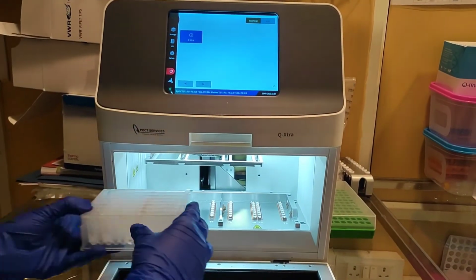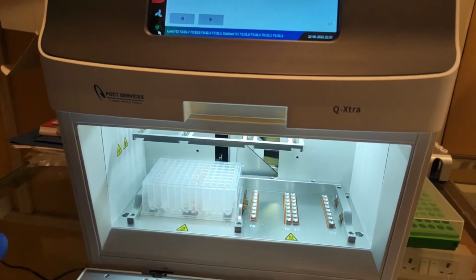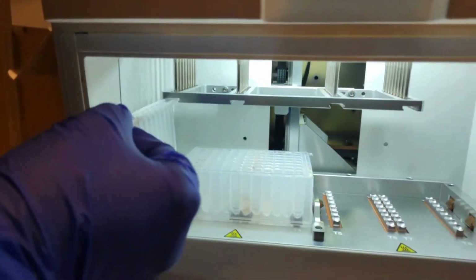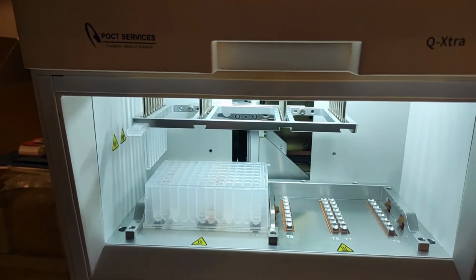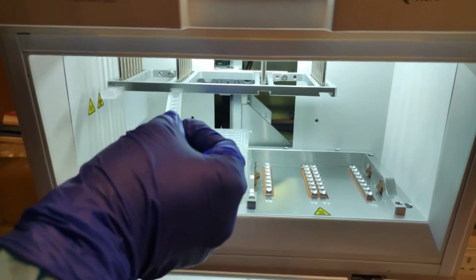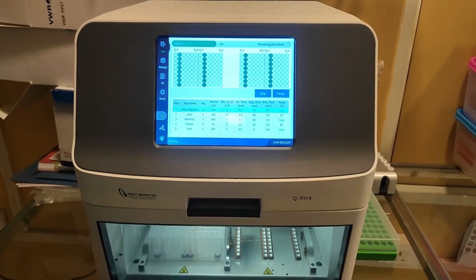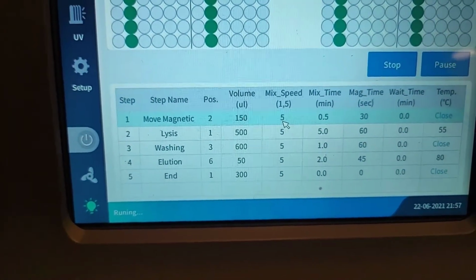And now placing the extraction plate in the RNA extraction machine. Inserting the comb in the machine, making sure that the combs fit properly. Inserting the second comb, running the program. As you can see here, the steps of extraction are in the display.